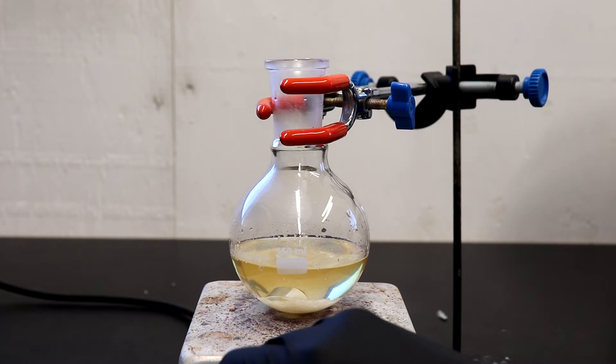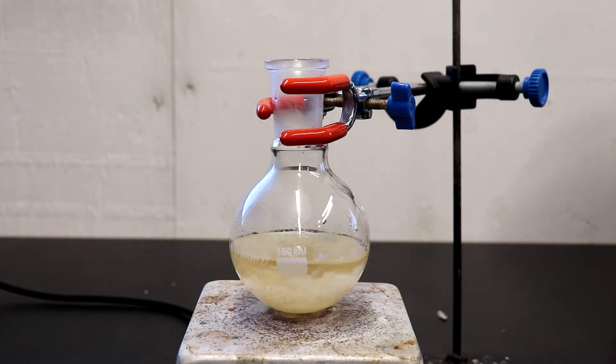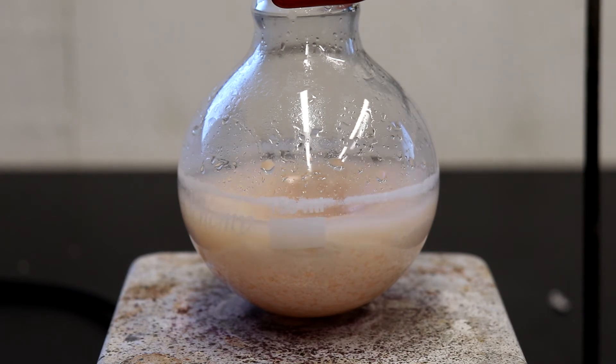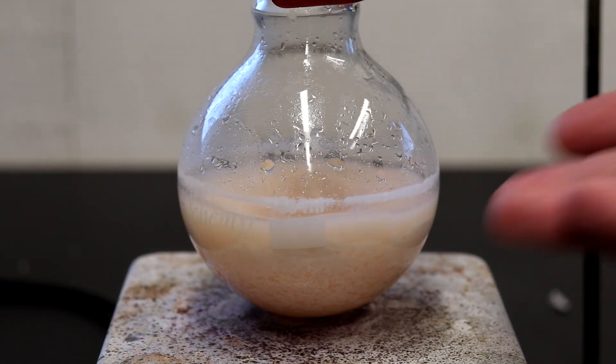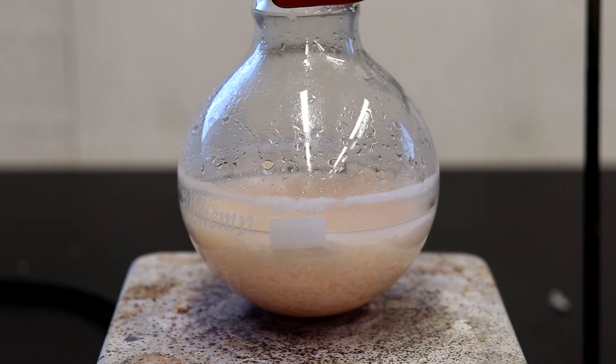And we're going to turn on stirring and we'll let this stir for 30 minutes. So you can see all those flakes of potassium hydroxide have broken up and now we just have a suspension. So I'm going to turn off stirring. It's also gone a slight pink color and we're going to filter this.